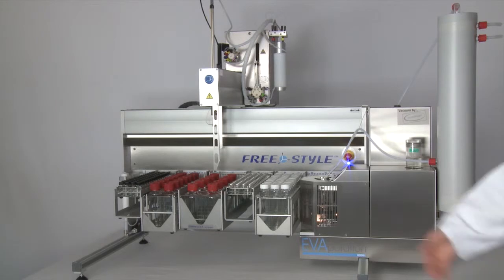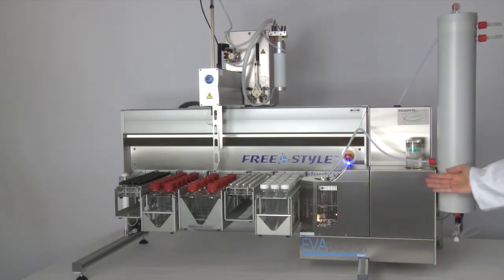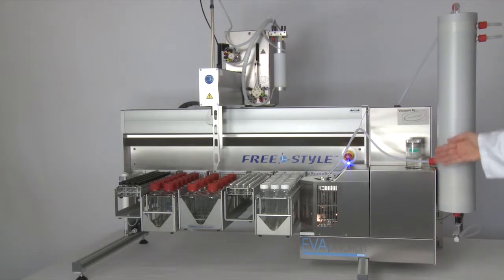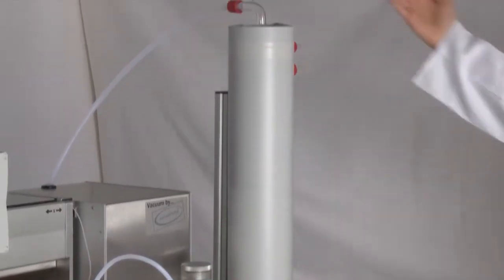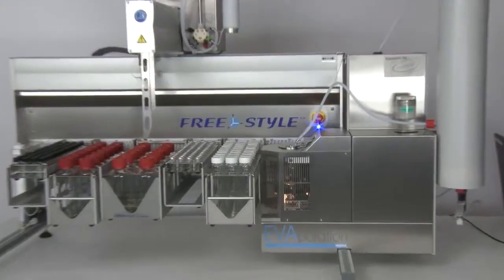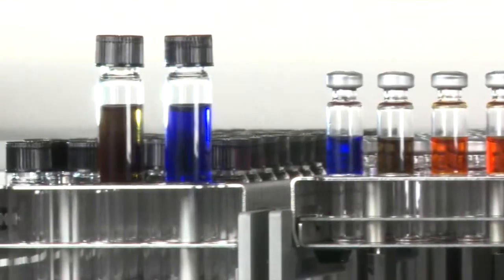The evaporation module consists of an evaporator flask, a heater which is integrated in the housing, a frequency-controlled chemically inert vacuum brand membrane pump, and a cooler for solvent recovery. The FREESTYLE system with the evaporation module has many different uses.